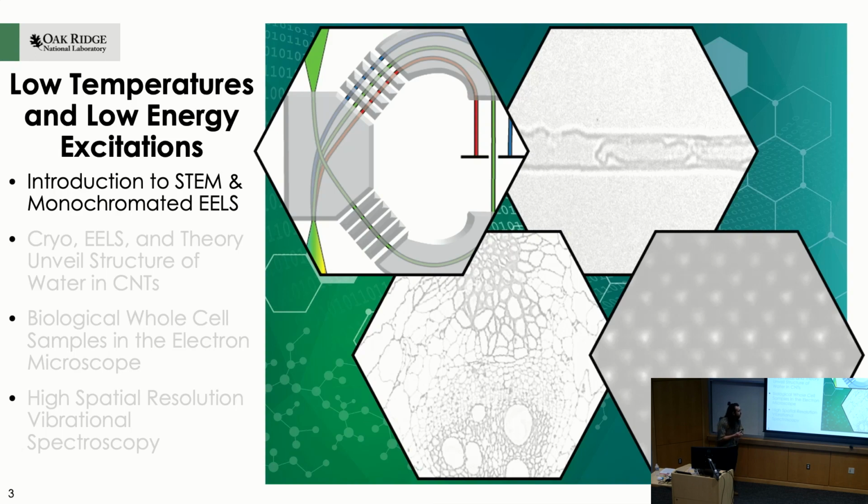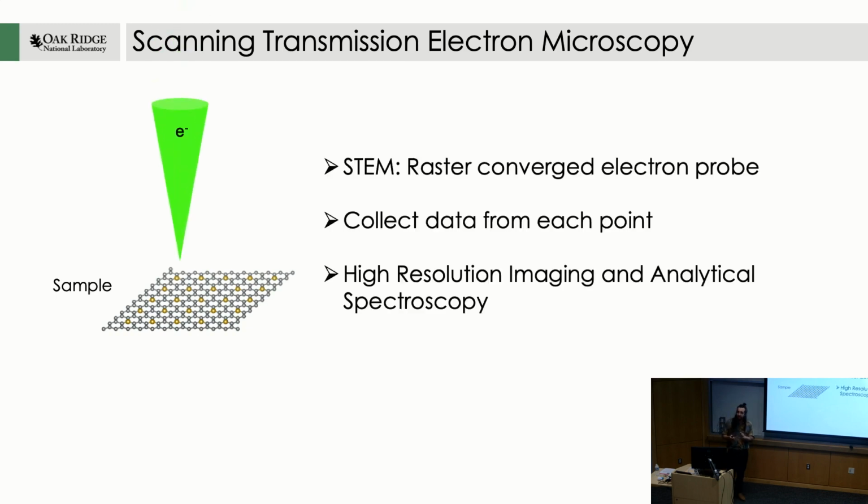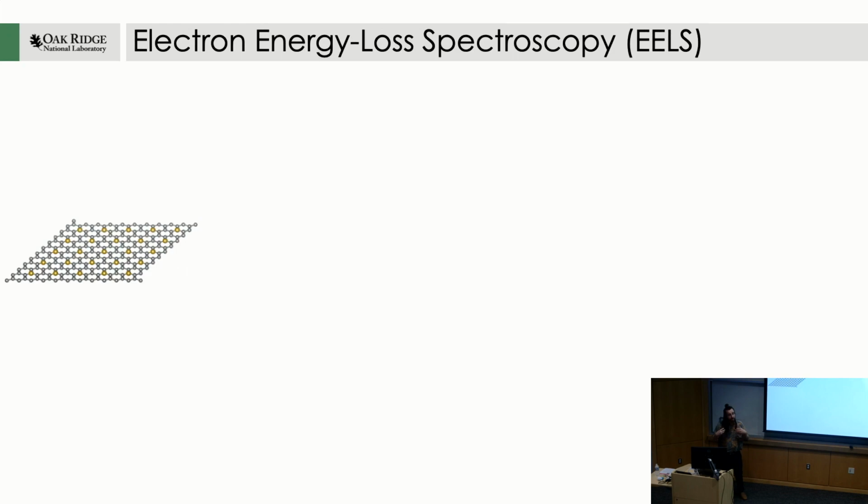So starting off with the intro. The technique I do is called scanning transmission electron microscopy, which is different from standard TEM in the fact that we take a converged probe and raster it back and forth across the sample. The idea here is that we're acquiring data from each point individually rather than from the sample as a whole, and we're correlating the signal on various spectrometers and detectors with the probe position as opposed to doing any actual imaging. And the type of analysis I like to do with this is electron energy loss spectroscopy.